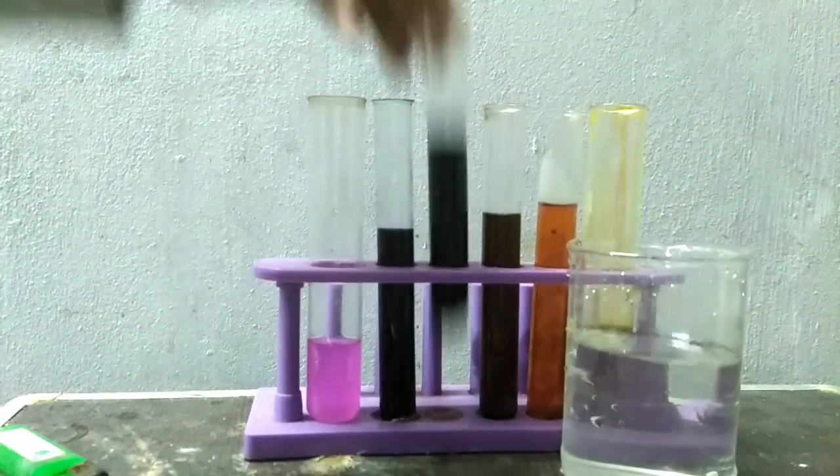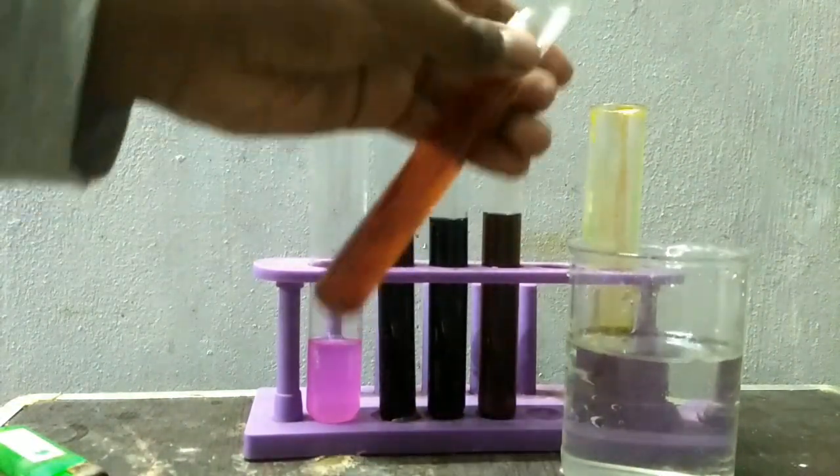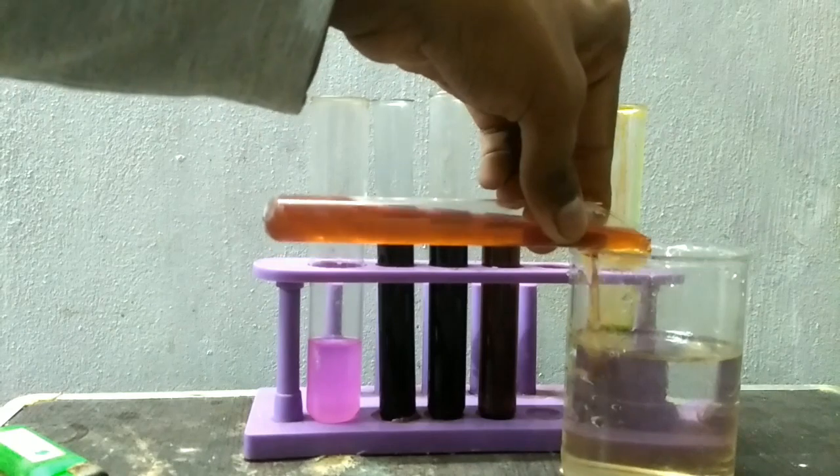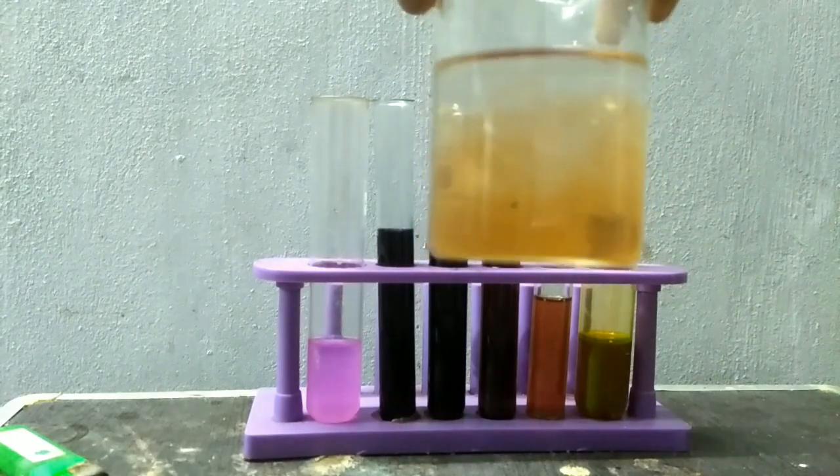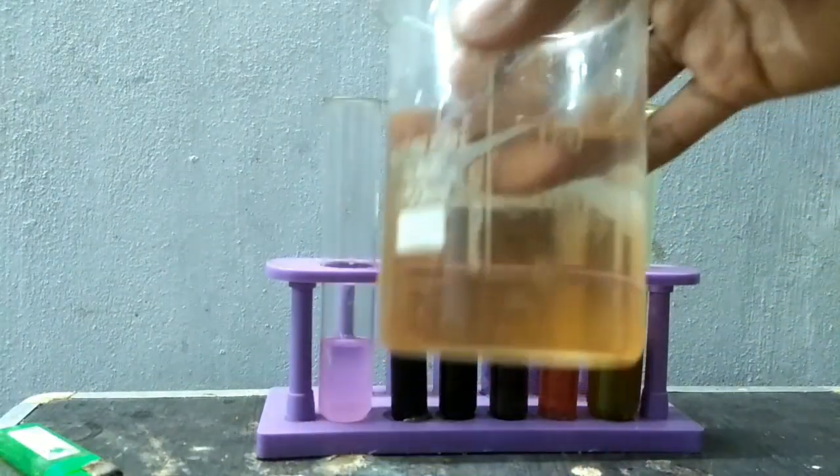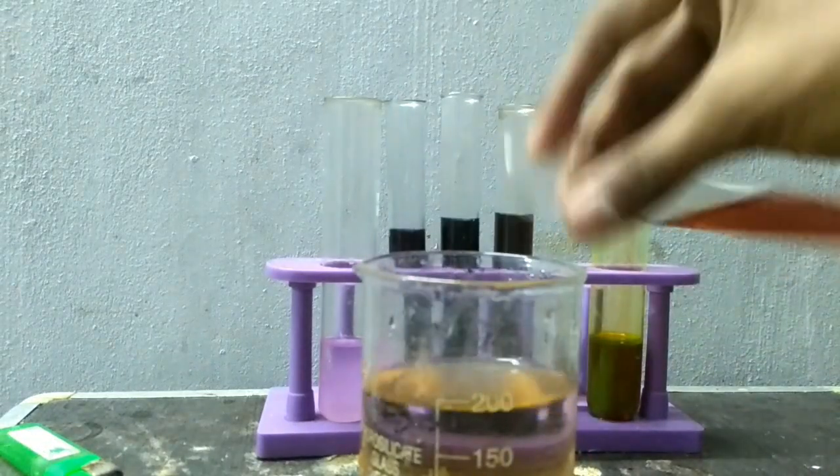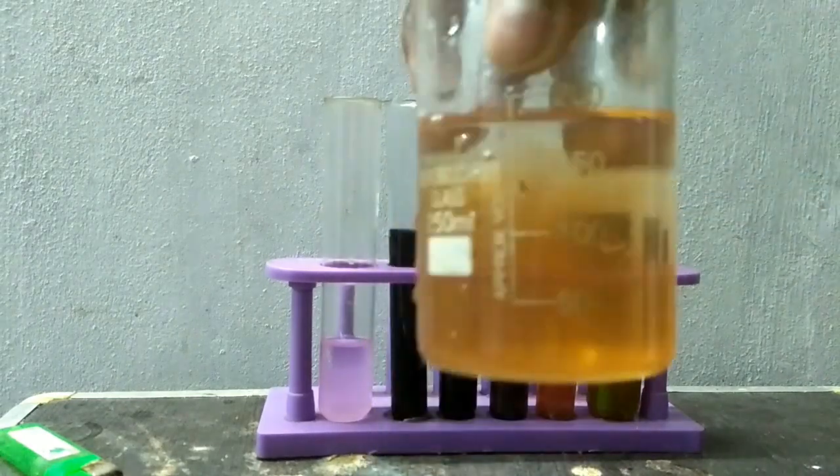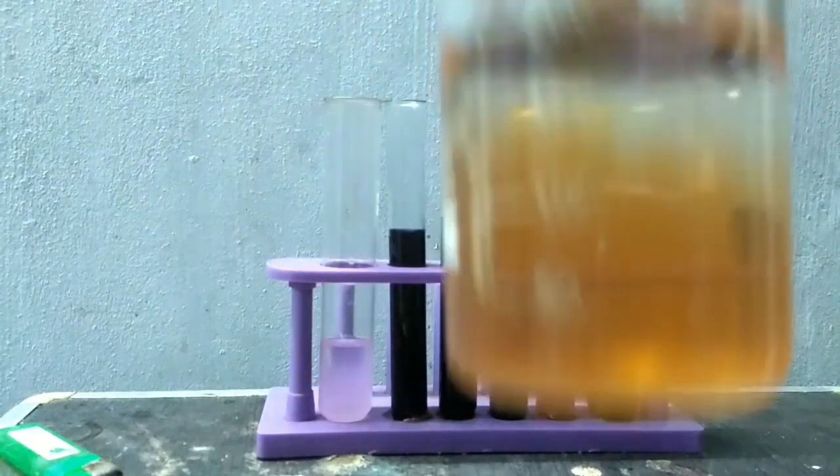Now observe the color of the dyes we have prepared by adding in water. This is the salicylic acid one. You can see that the orange color is there, or this is the red color instead. Let's add more. In the camera it's orange but I can see it red.